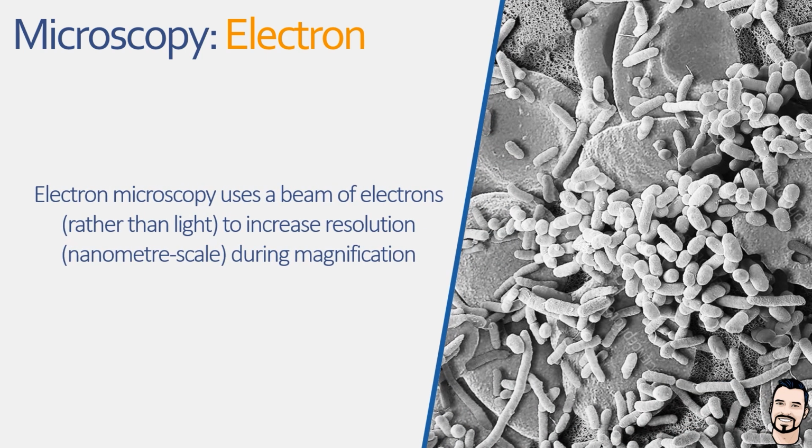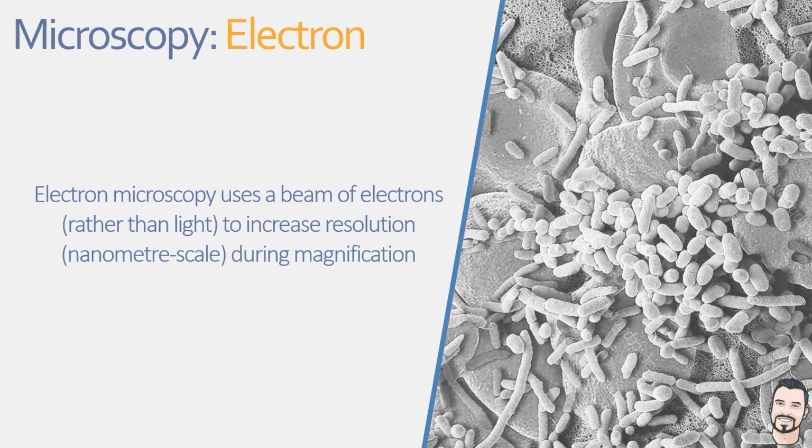And I guess finally, here we have a scanning electron micrograph, or SEM, showing bacteria amongst red blood cells in the circulatory system. The SEM image provides a detailed 3-dimensional view of the surface structures by bouncing electrons off the sample, allowing us to see various bacilli-shaped bacterial cells covering erythrocytes.